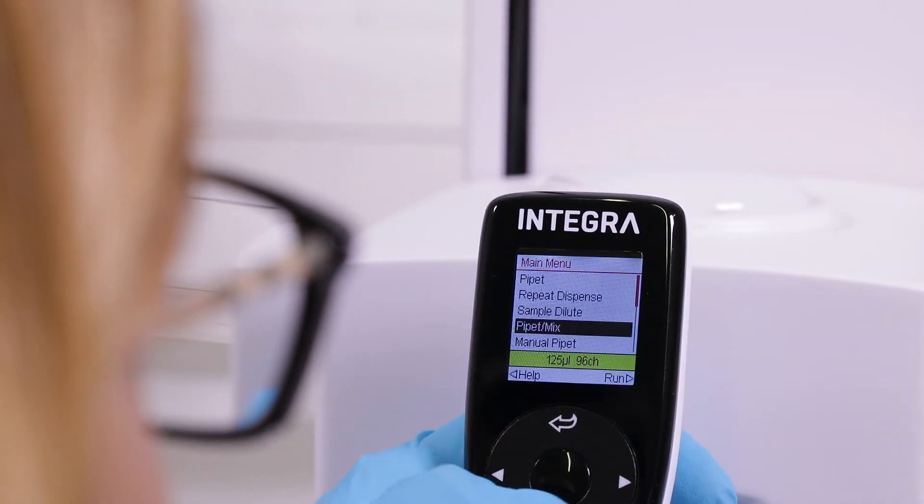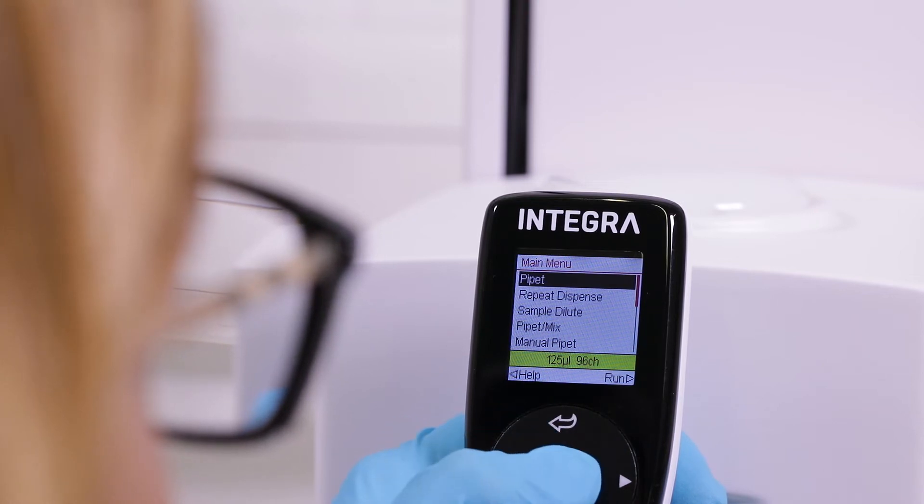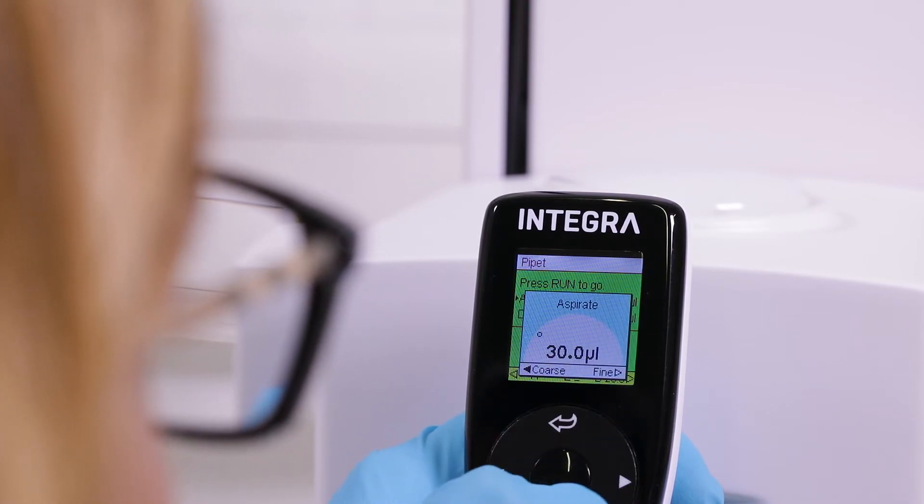The easy to use touch wheel interface allows for convenient menu navigation, as well as quick volume changes.